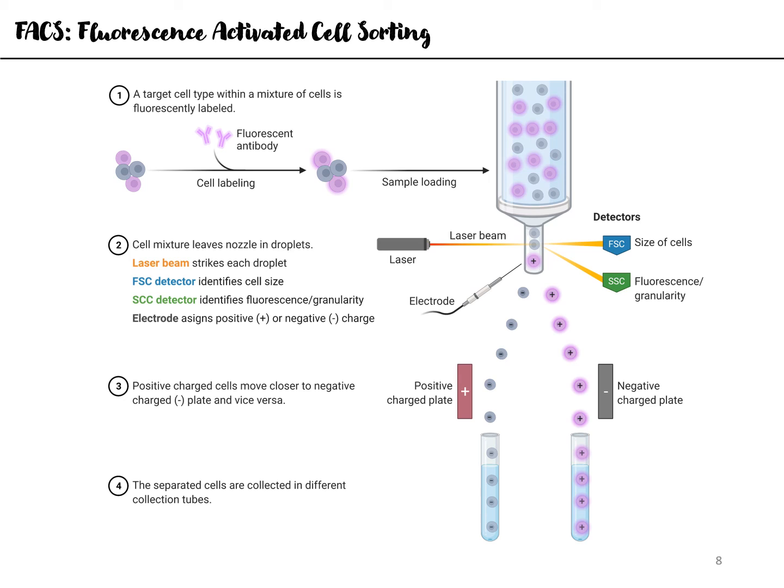So how exactly will you identify that, okay, if my cell population is showing up in this specific region of the cytogram, I will consider it to fall under this particular population? So for that, you do require a lot of prior knowledge and some experience with the particular type of sample that you're dealing with, and it is something that you have to optimize for your specific sample.